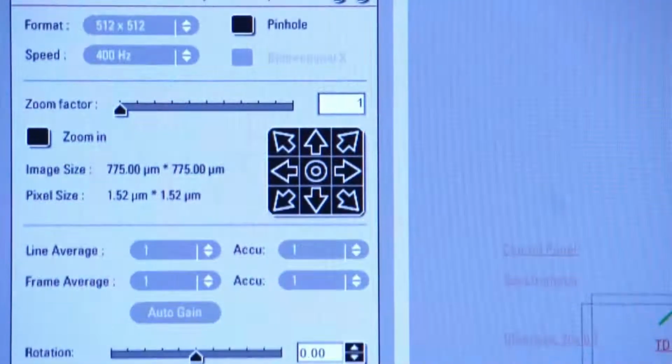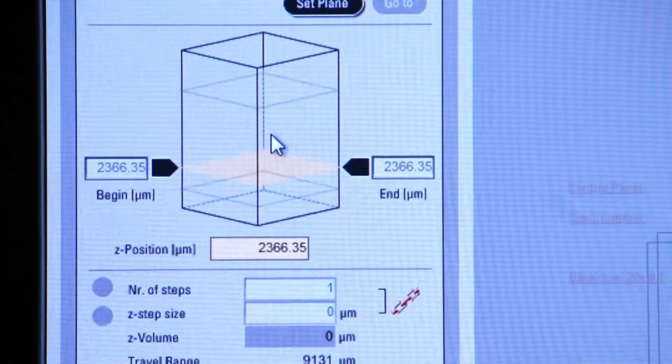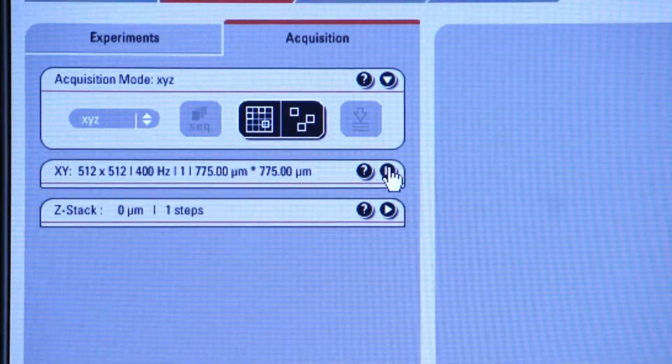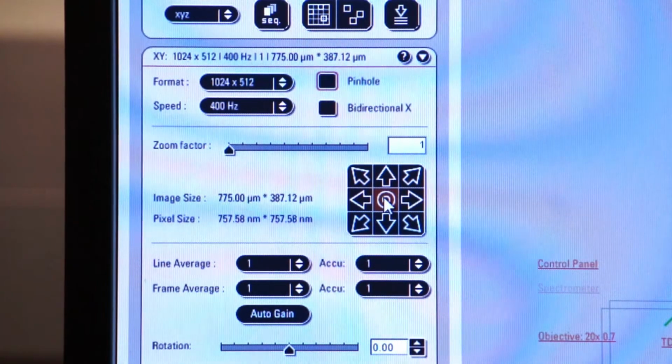When the system first initializes, you will see the Z-Stack tab. But for now, and by way of review, we'll go to the middle tab, which is the XY tab. These series of arrows, which are useful to direct the right monitor, not this monitor, but the right monitor image to a specific region of interest. So we'll cover that also a little bit during this session.